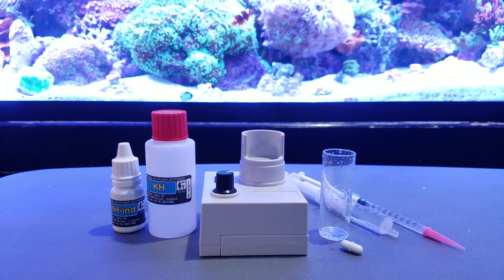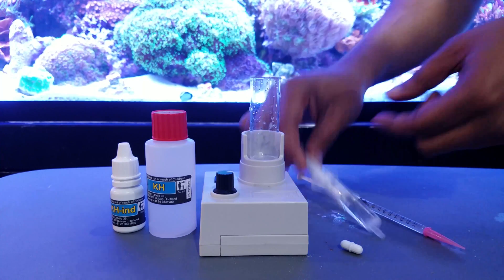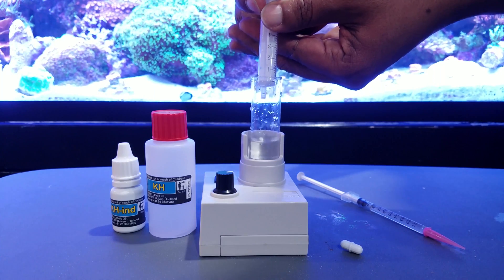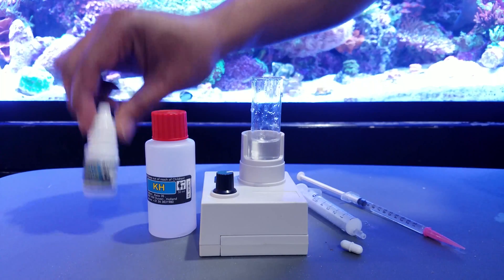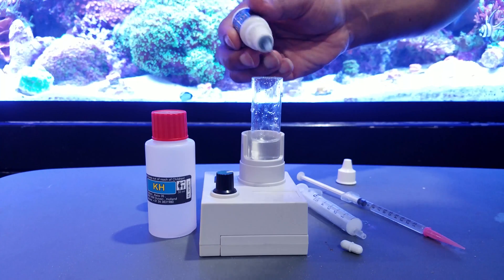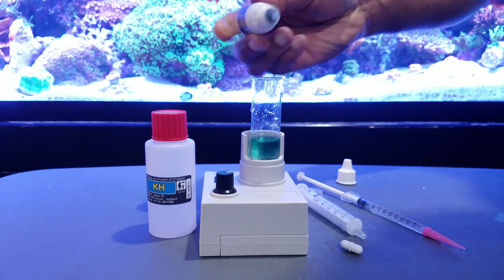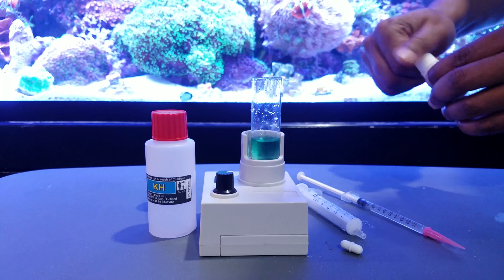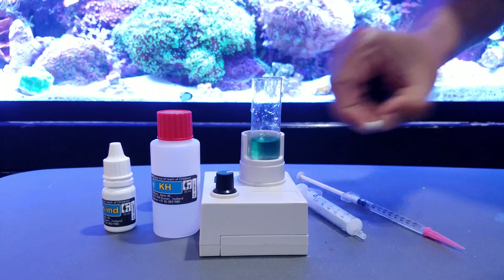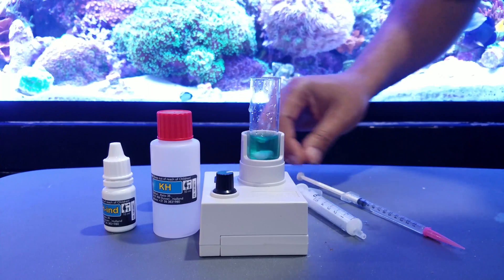We're going to do a quick test with a Salifert alkalinity test. First, place the vial on the speed test kit and add four milliliters of saltwater to the test vial. Then add four drops of bottle number one into the vial. Next, add the magnetic stir pill to the vial and turn the power on — the pill will start to spin and mix the solution.